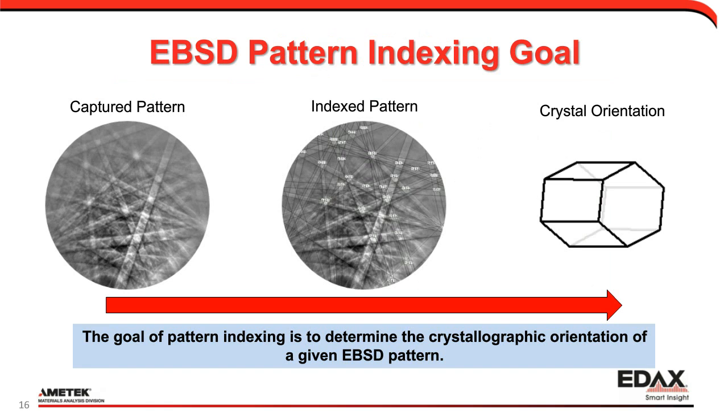Okay, so those are some of the introduction to the look and feel of the software. But of course, that's not the primary goal of the software. The primary job of our data collection process is to be able to capture and index an EBSD pattern. And when I say the term indexing, what I mean is we're trying to determine the crystallographic orientation. So we capture the pattern. The term indexing means we're finding out where the planes are located, which tells us the crystal orientation. And that's really what we're trying to do.